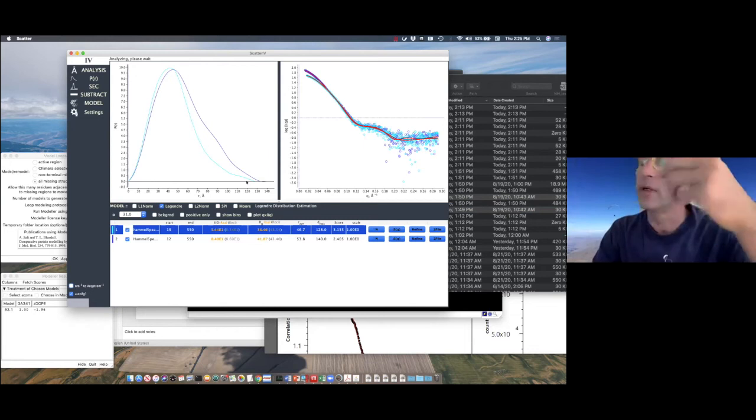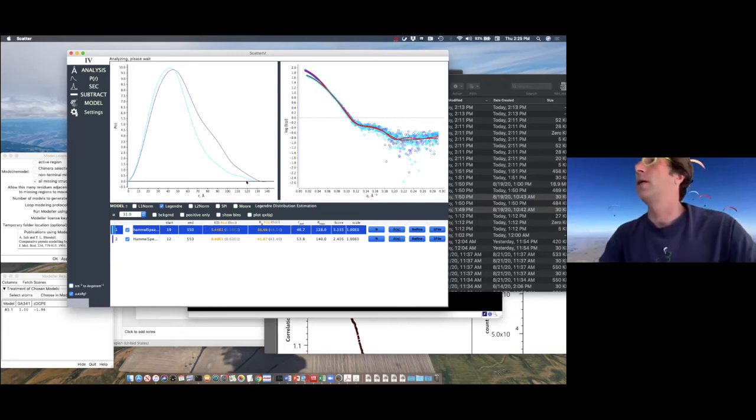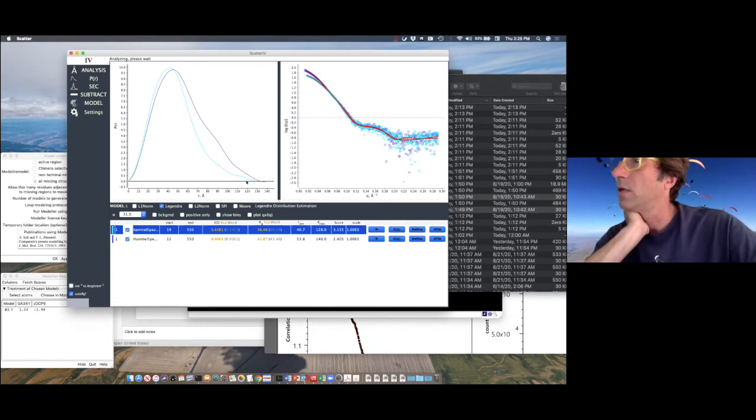We can go now and confirm the molecular weight in SEC-SAXS. And don't take me wrong, Rob, but I really prefer using the ATSAS package to define the molecular weight from the SEC-SAXS. How much difference between Rg real and reciprocal is acceptable?